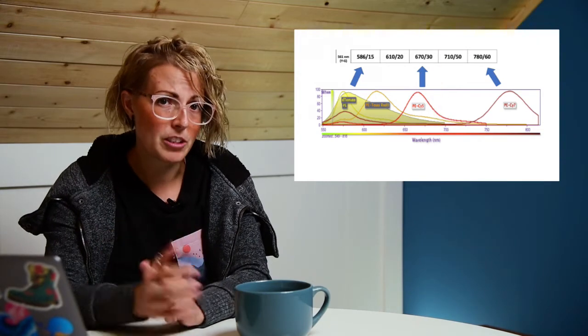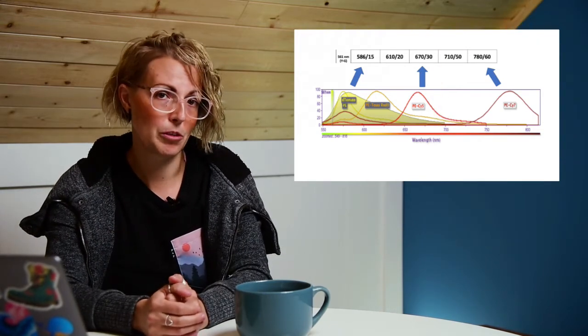So these are the things you can start thinking about when selecting your fluorochromes when you have 6 or fewer. So once you've selected your 6 fluorochromes and got them into your lab, the last and final step of any panel design is to test your panel.